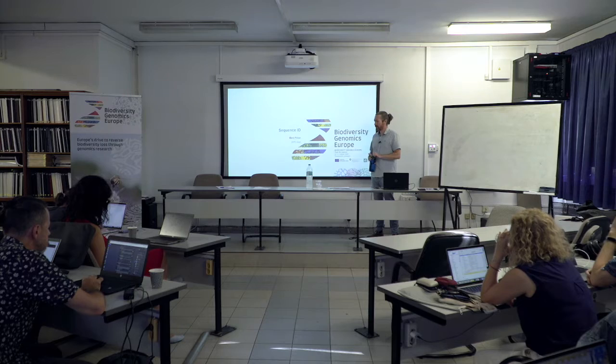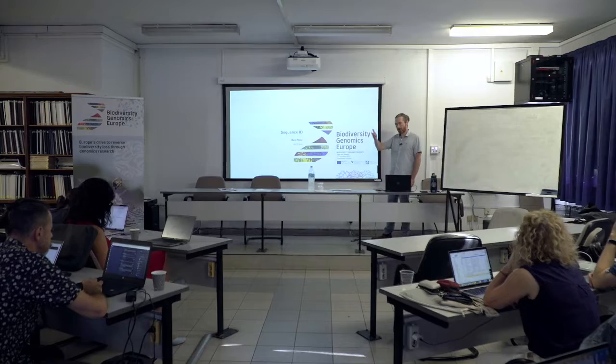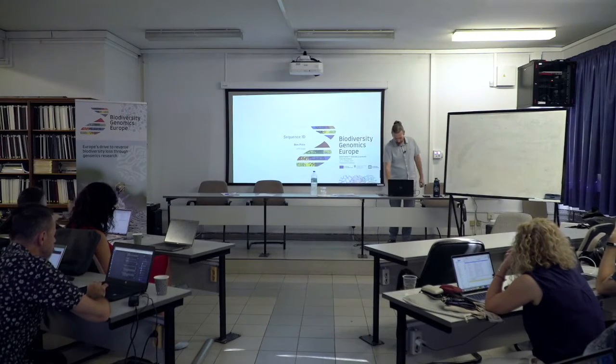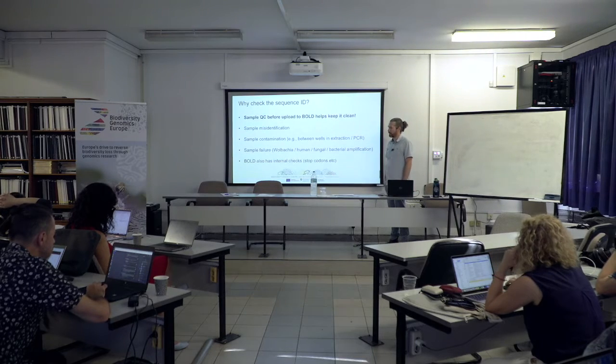So yeah, I've got three topics. The first one we're going to talk about is identifying your sequences after they've gone through ONT barcoder. Feel free to follow along with the software itself if you've got it installed, but at least two of them are web-based, so you could just go and play with it while we do it.